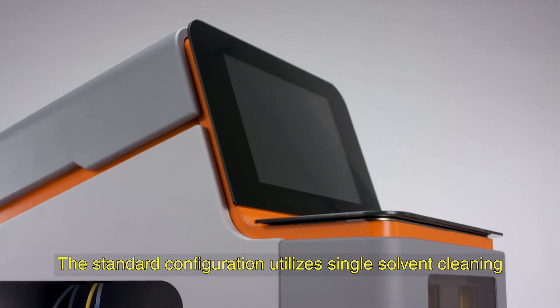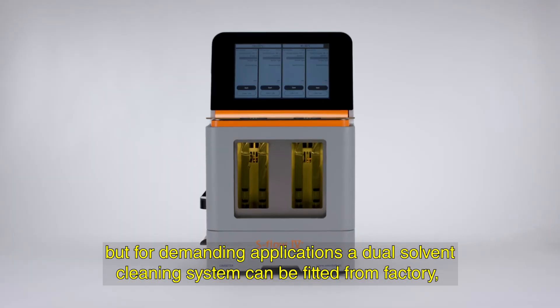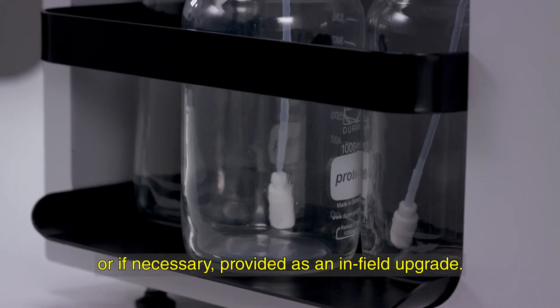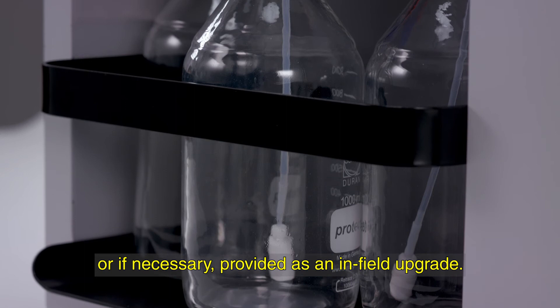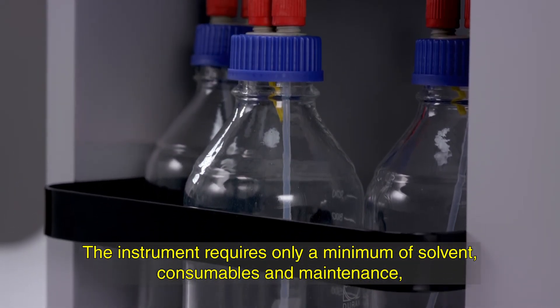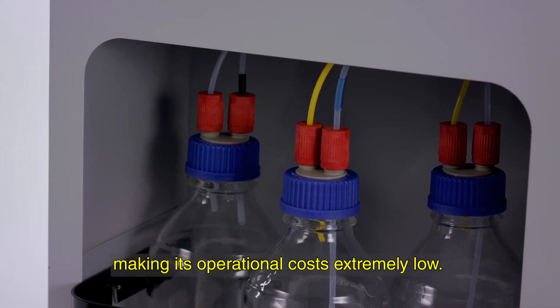The standard configuration utilizes single solvent cleaning, but for demanding applications a dual solvent cleaning system can be fitted from the factory, or provided as an in-field upgrade. The instrument requires only a minimum of solvent, consumables and maintenance, making its operational costs extremely low.